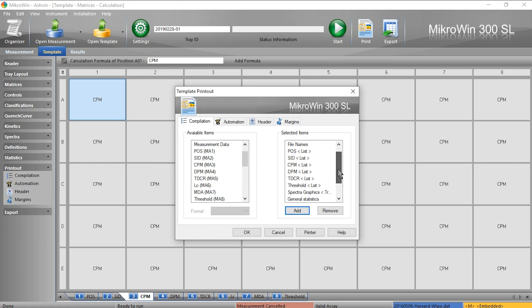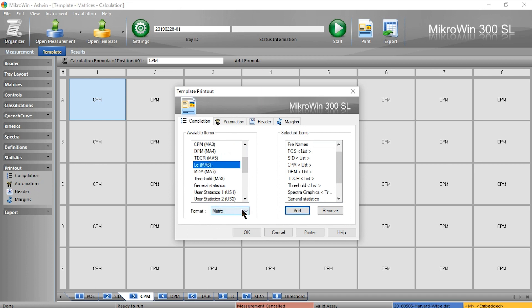If I wanted to add data to the printout I can select it from the left. The format will give me a choice of matrix or list. Matrix is a quick format and not recommended. List is the most common and user-friendly format.